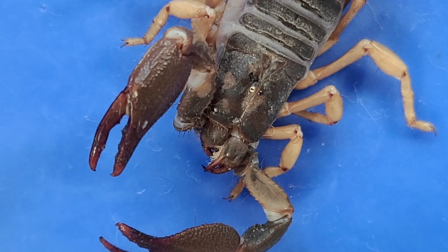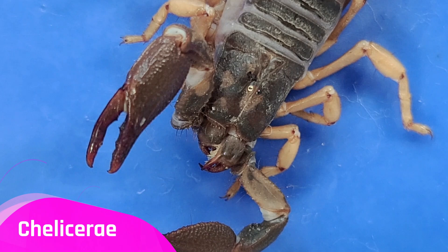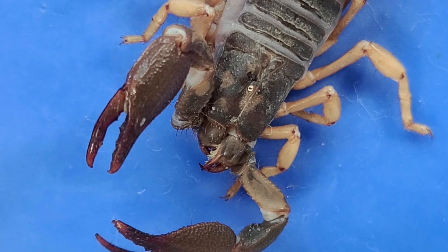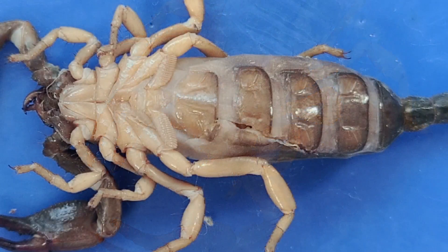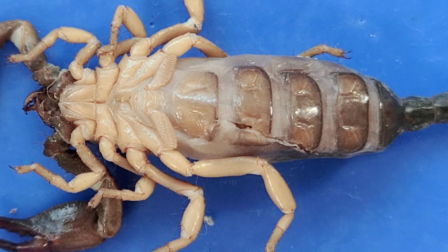Now at the very front of the cephalothorax are these two small appendages. These claw-like structures that protrude from the mouth are called chelicerae, and they're basically the scorpion's jaws, holding the prey while the scorpion eats. Now I'm going to turn the scorpion over. These two plates below the chelicerae are called the coxapophyses, and they chew the food.